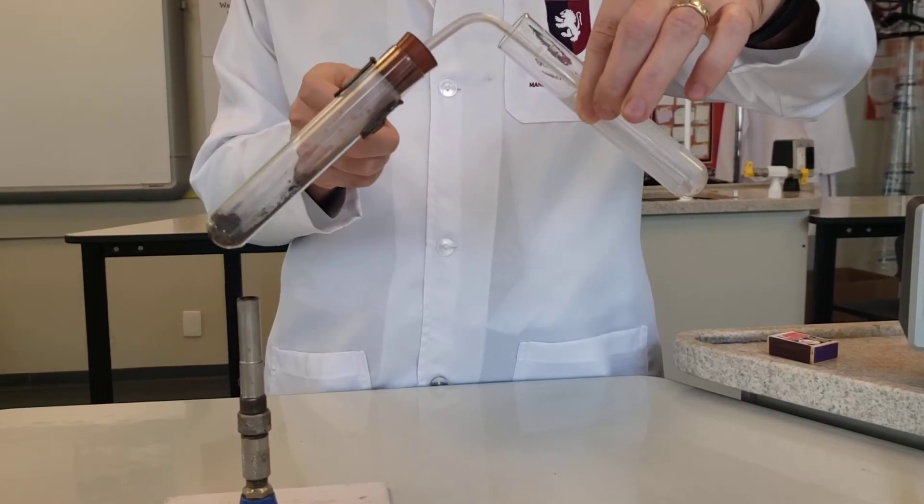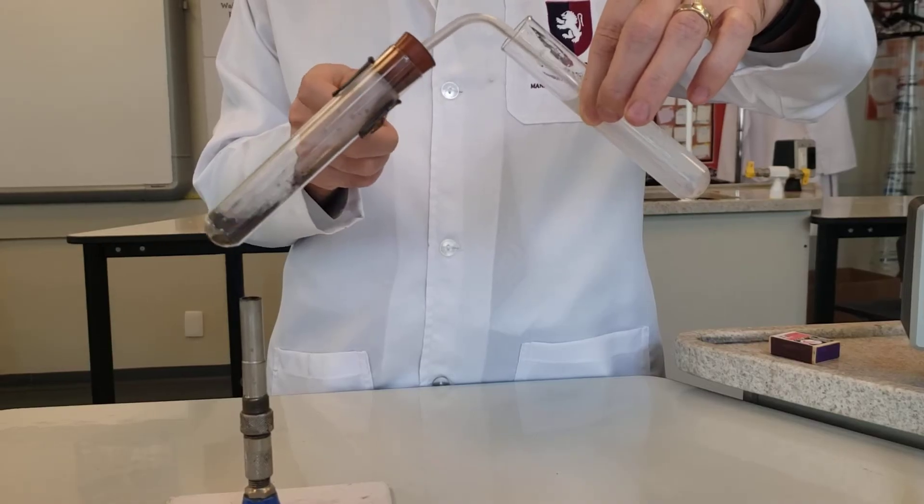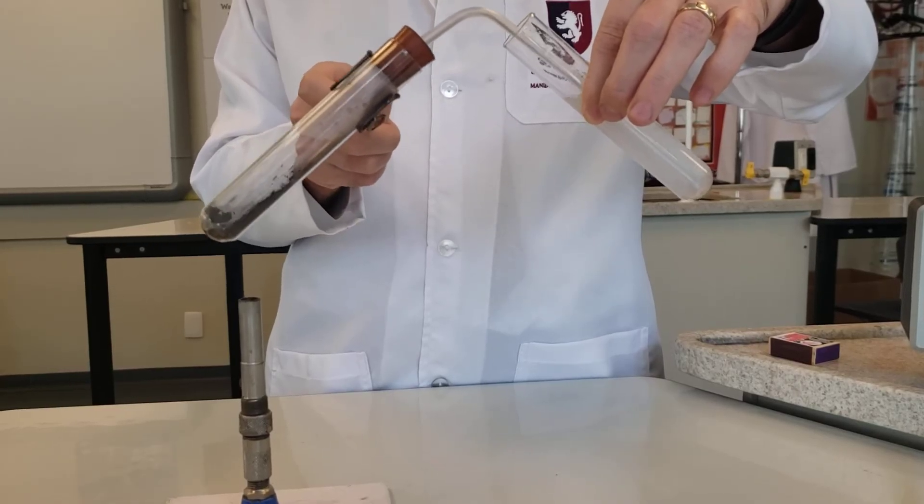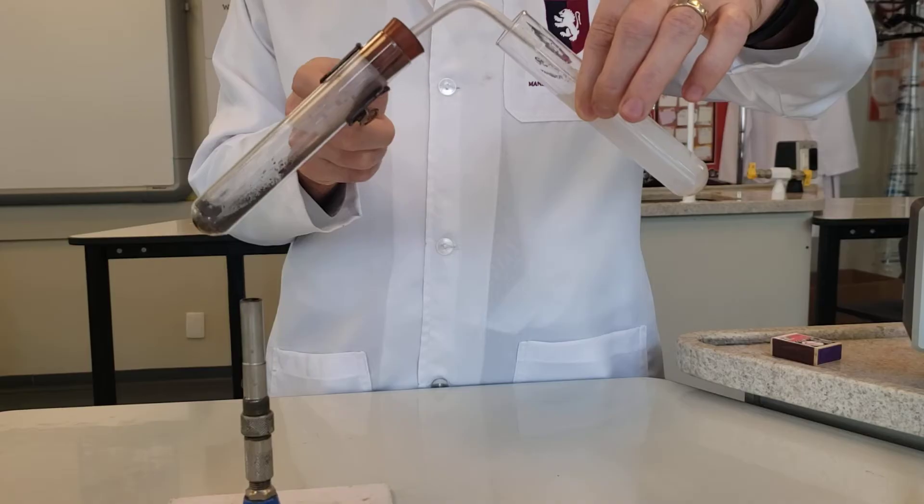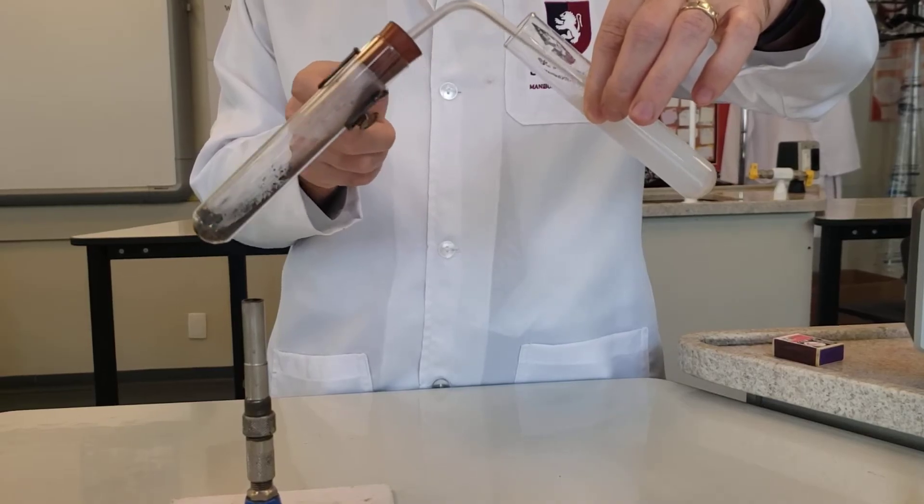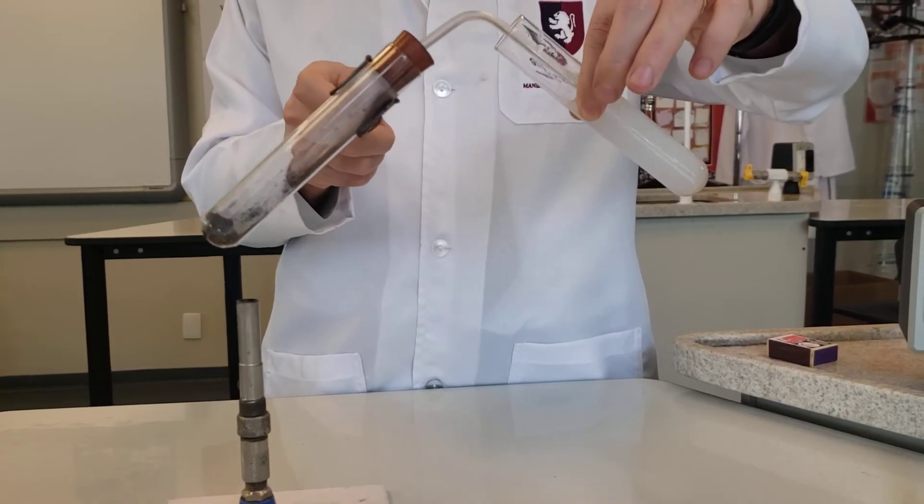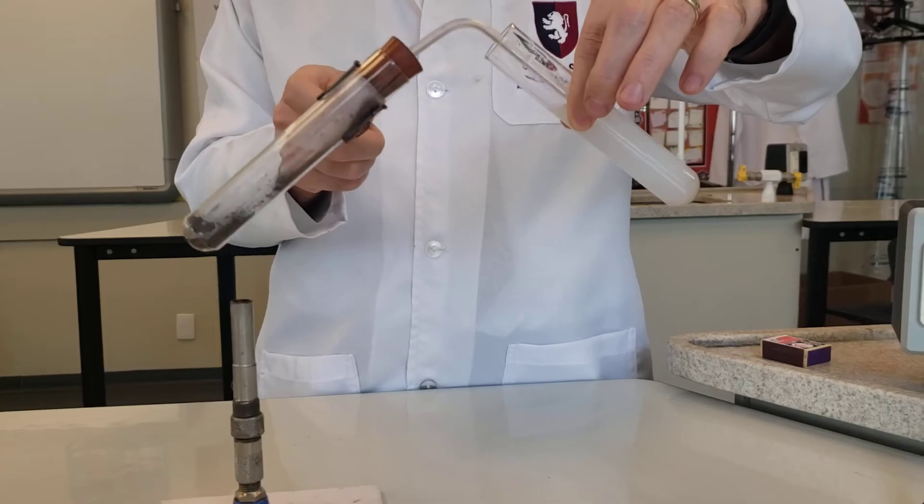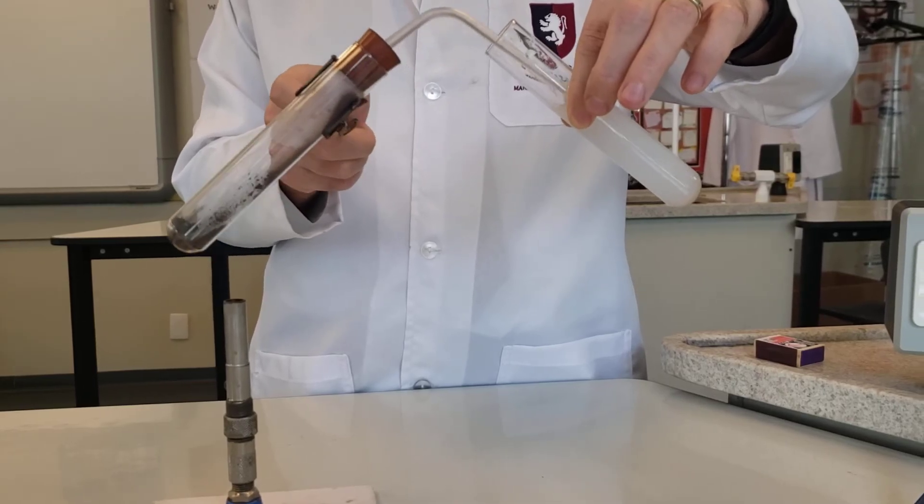You can also see some condensation at the top of the tube. That shows maybe water coming out of the copper carbonate. So it's hydrated copper carbonate. And also now you can see my lime water is going milky.